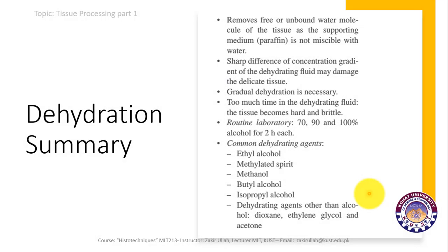This is the summary of dehydration, the different overview and the different points about dehydration. For routine laboratory, 70, 90 and 100% alcohol each for 2 hours, and the common dehydrating agents are these listed here and they are discussed in the previous slide.